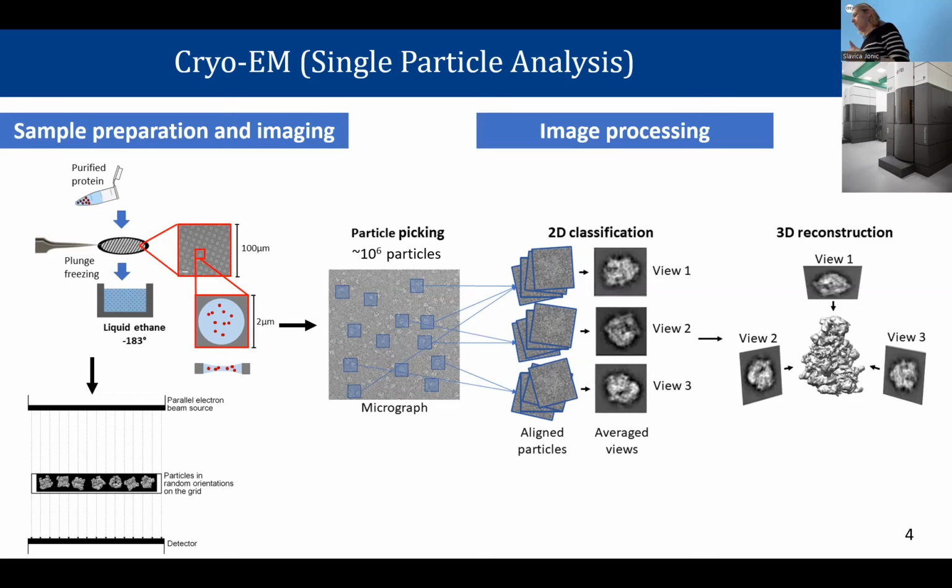For this, we have several approaches. You can do it from scratch, or you can use some preliminary shape, and then you orient your images with respect to this shape. So we speak about angular refinement. We assign to different particles the corresponding views, depending on which projection best matches your image. At the end, here you see 2D classification. This is one of the steps.